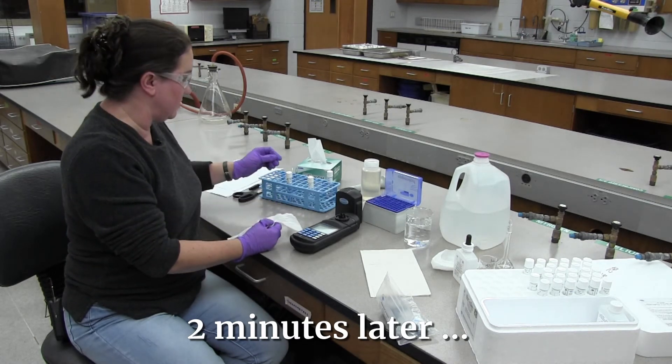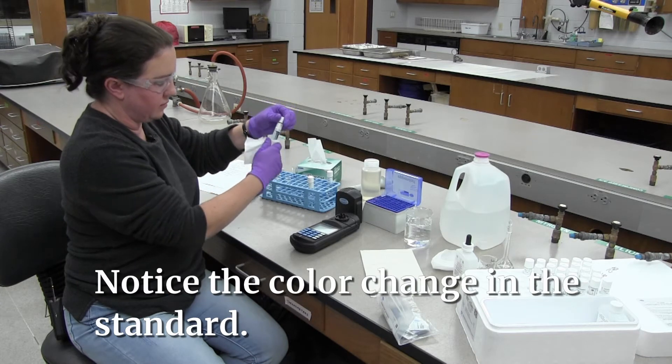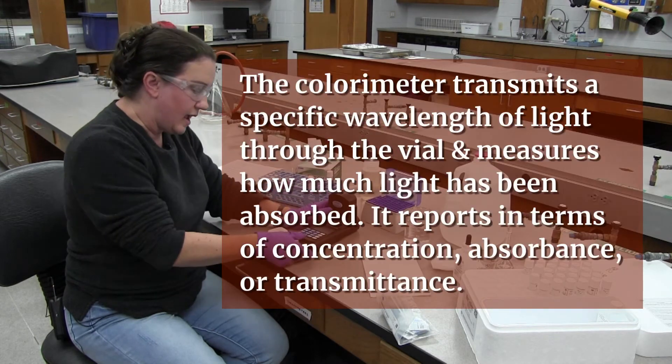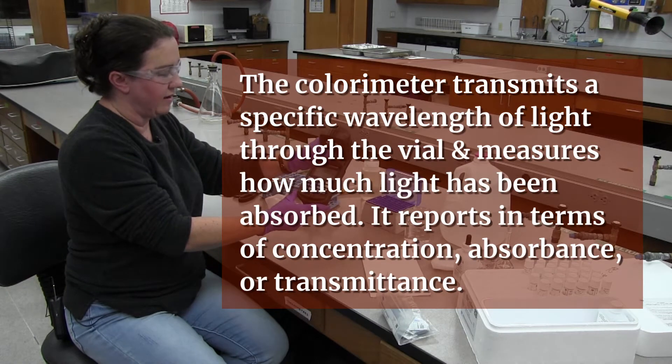Our two minutes is up. We're going to take our vial — make sure you wipe it with the chem wipe before reading — put it into the holder, put the cover on, and press read to get our result. It's 1.85 milligrams per liter.